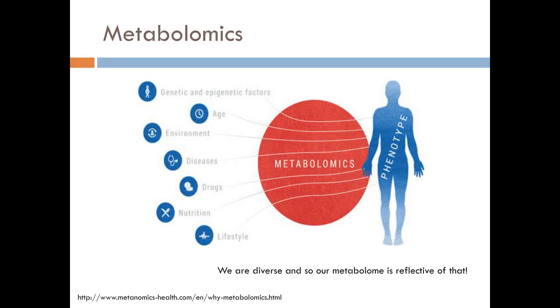So if you're not familiar with metabolomics, I'll give you a short overview of it. Metabolomics covers a wide array of things that are in our body, including the genetics that is a part of us. Our age determines some of what our metabolome looks like. Where we live, the environment, what we ingest, all goes into our metabolome. Of course, if we have an illness or if we're not feeling well, those have effects on our body, and those are often seen in the metabolome. If you're taking a pharmaceutical or over-the-counter drug, you'll see metabolites from that drug. That's part of the exposome.